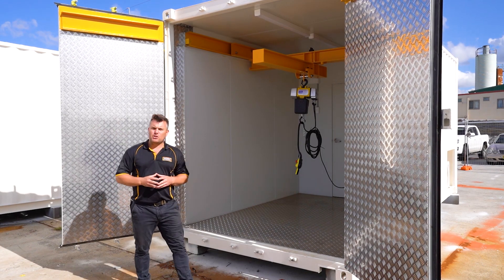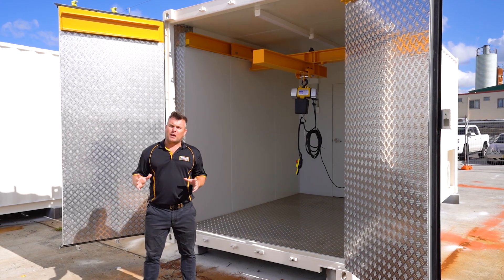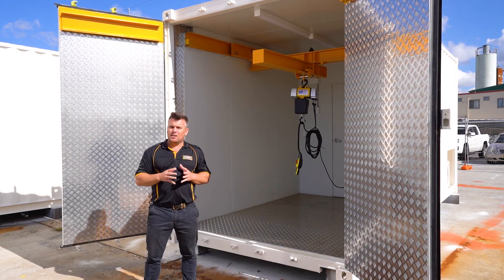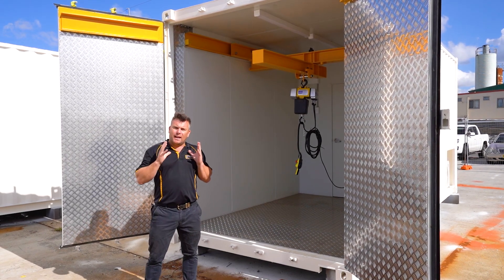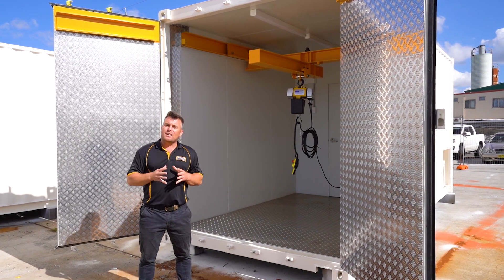Thank you so much for joining us on another walkthrough video — it's absolutely incredible what we can do inside of these shipping containers, and this one is no exception. This one's fit for purpose and we cannot wait to see it out in the field in use next week.